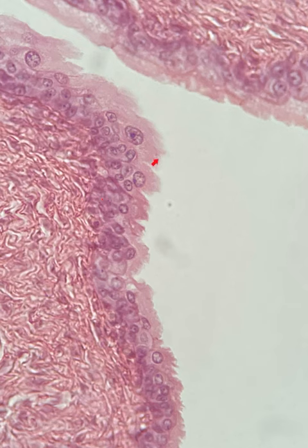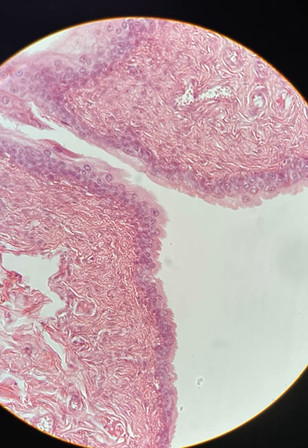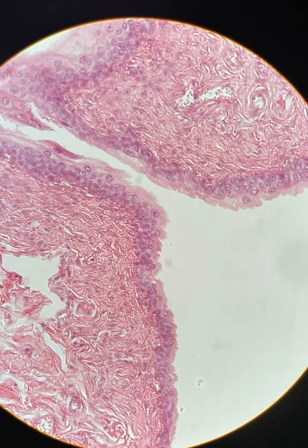You'll also see these umbrella type cells along the top. And that's what this is. This is a transitional giveaway. You definitely know that these are transitional cells. Now, these cells are usually found in the bladder, and they allow for storage and expansion of the bladder. So transitional in general, that tissue is going to allow for stretch and storage.